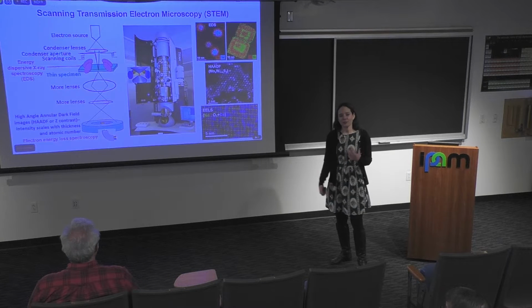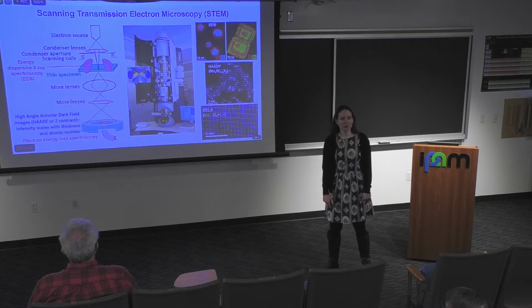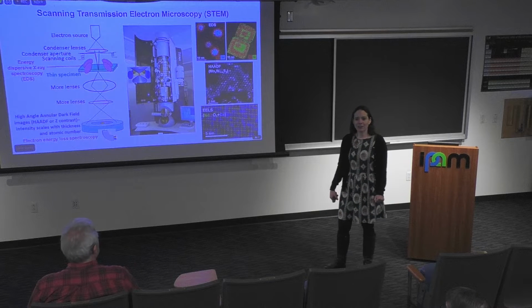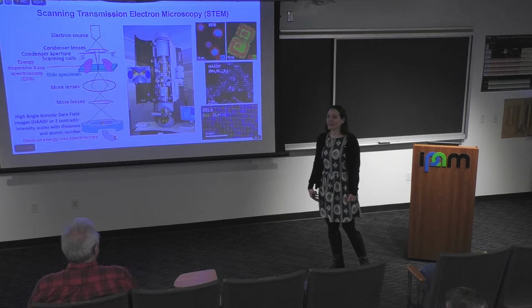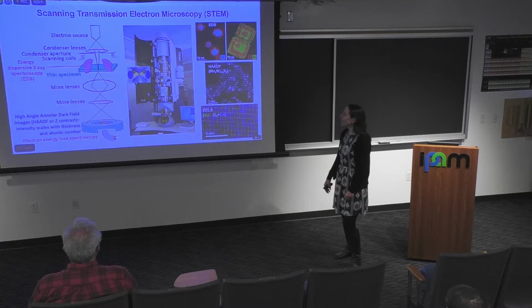Okay, so I'm a transmission electron microscopist. This is a scanning transmission electron microscope. Hopefully most people in the audience are vaguely familiar with a scanning TEM. Fantastic. So this is the one in Manchester.